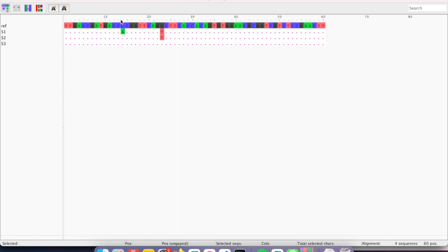So we can look at this and identify straight away which positions are different. And really, we are probably mostly interested in differences. In this case, we could easily store this, and it's fairly small, but in the context of a human genome or a large bacterial genome, it's probably not efficient to store everything that we see for each sample. So instead, we can simply store the positions which are different from the reference, because we know the reference sequence and we can easily see then what the differences are.